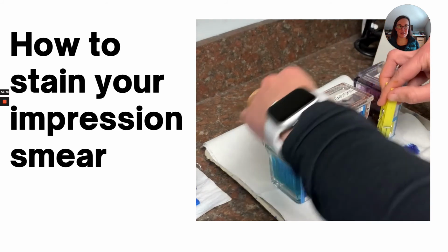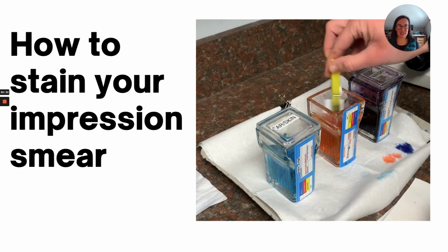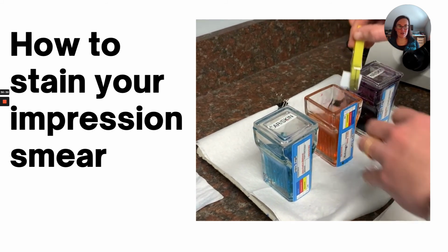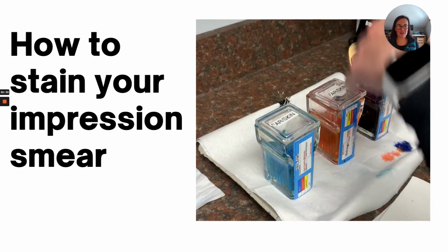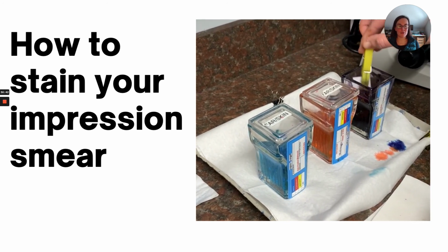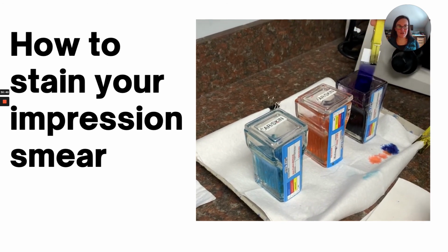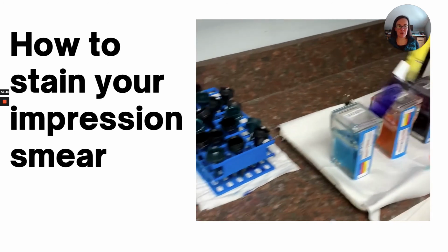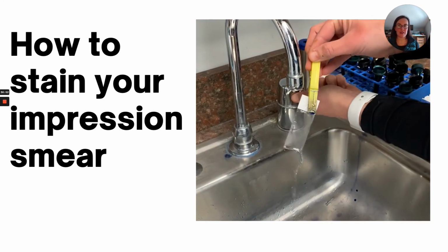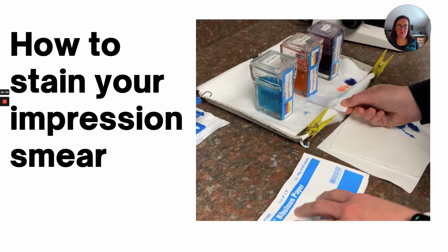So it's going to be something where you jangle it in the fixative for a little bit, 15 seconds or so, move it around in solution 1, get your eosinophilic stain, and then move it into your methylene blue, solution 2. Long enough, and then you're going to rinse it. Sometimes people notice that oily film that covers in their methylene blue, that's actually the eosin. So you can rinse them off between samples.